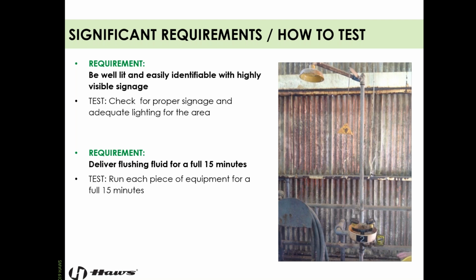And we want to make sure that that is being utilized, that full 15 minutes, because when paramedics arrive and they need to take you to the hospital, a lot of times they're going to ask, how long have you been in there? What does the SDS call for? And the first aid measures, because they need to know, one, what they're dealing with, two, if it is completely off of your skin. They don't want to remove you from that equipment and then take you to the hospital and find out it's still on you and still damaging you. That's going to cause a pretty horrible situation where you're going to continue to get damaged on your way to get cared for. So very important.